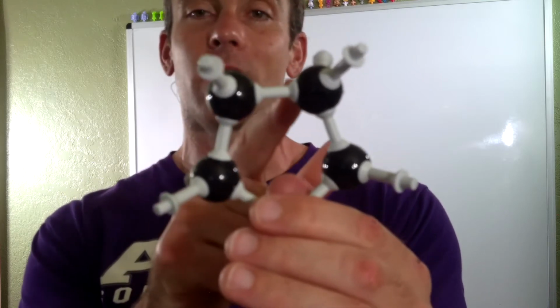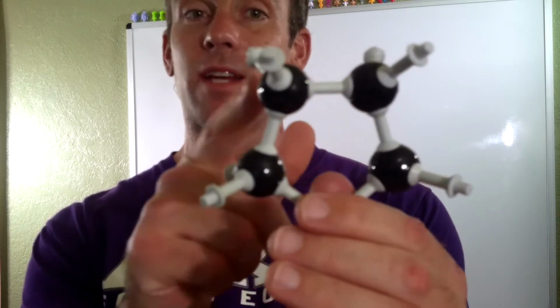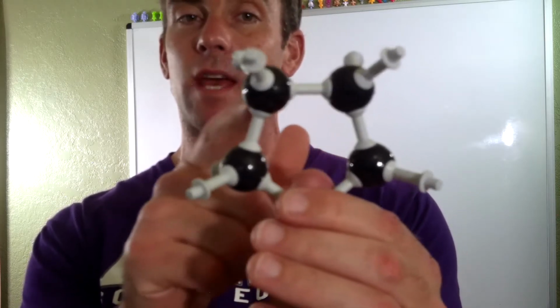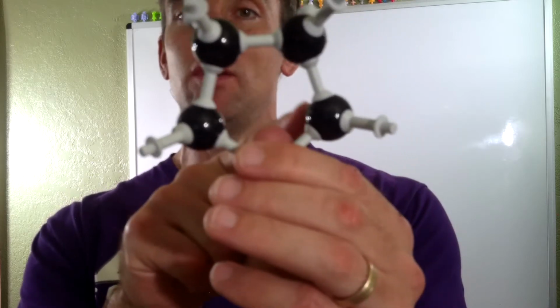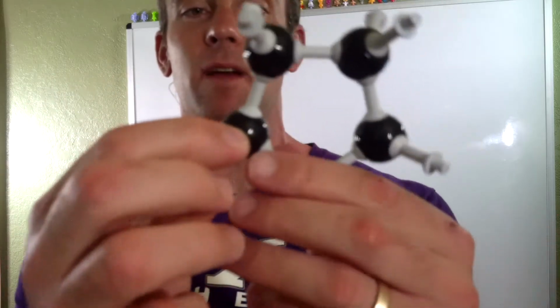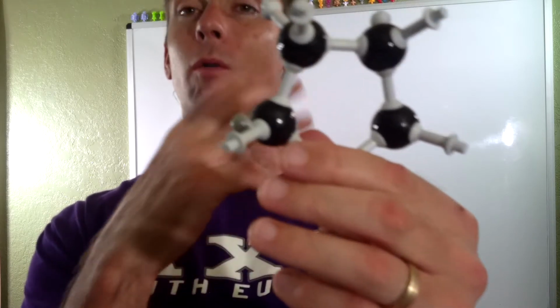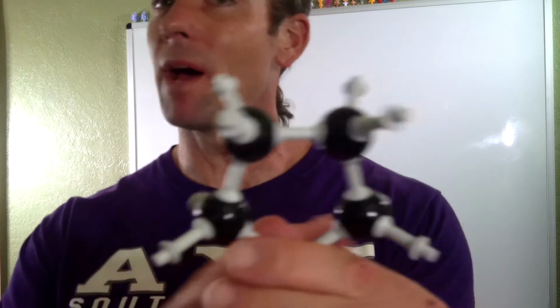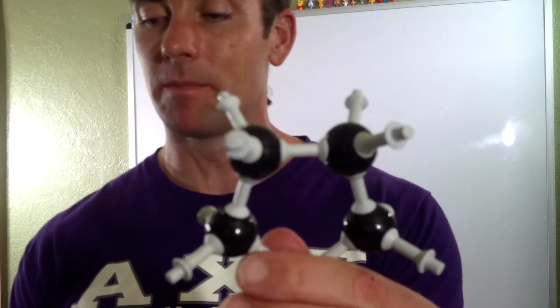We are either a carbon that looks like this, which, by the way, via symmetry plane is the same as this over here, right? So those are going to both show the same peak in the NMR spectrum. And then you've got an entirely new type of carbon environment, which are these CH3s out at the end here. So these are going to show the same peak in the NMR. So overall, you'll end up with two peaks for something like butane. And keep in mind, all of this has to do with symmetry planes.